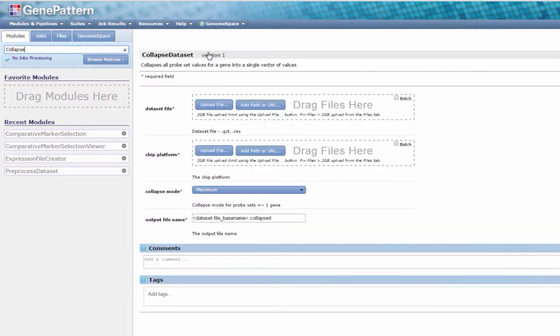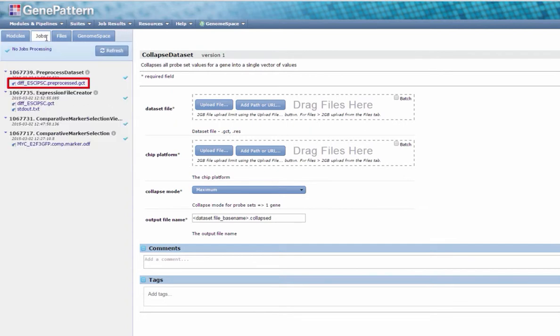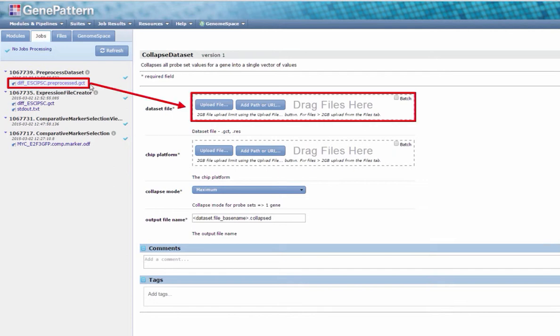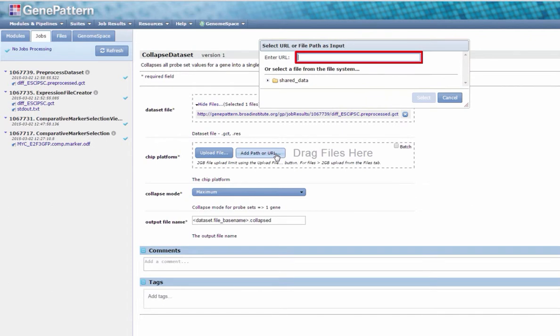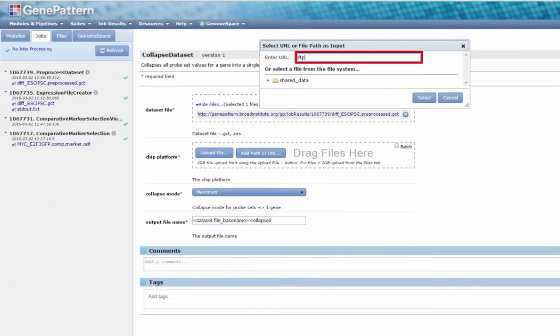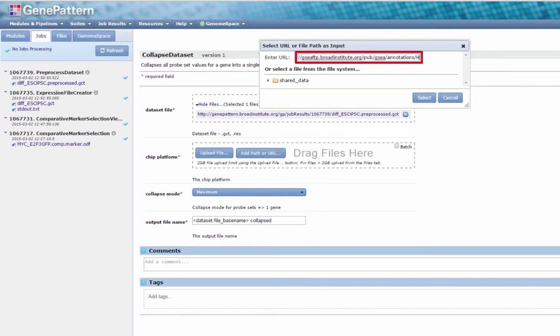Under the Jobs tab, click and drag the output from your previous job, diff-esc-ipsc.preprocessed.gct, to the Dataset File field. In the Chip Platform field, click Add Path or URL, and enter the URL to the file hgu133-plus2.chip. The URL may be found in this video's description.